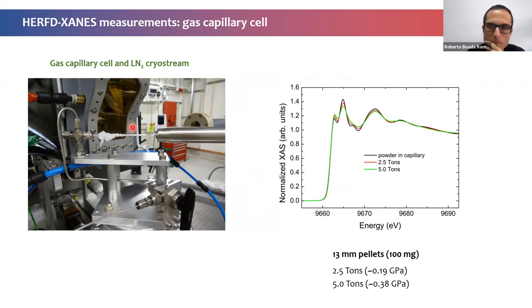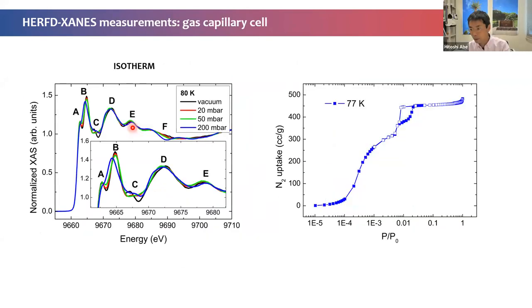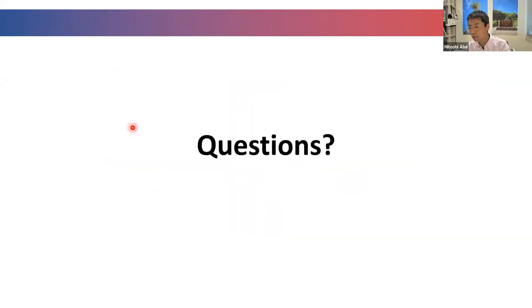Thank you. Any questions from Anna Zimina? Do you have questions? Yes, in the same direction. Okay, I just wanted to ask again. So you put your sample, the powder, in the capillary. Did you prepare the sample somehow before, press it, and so on?